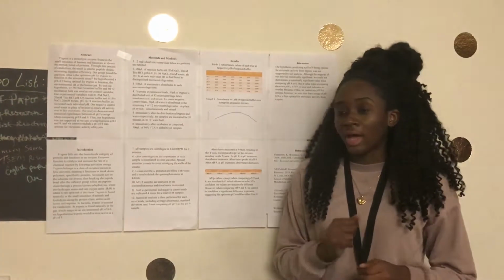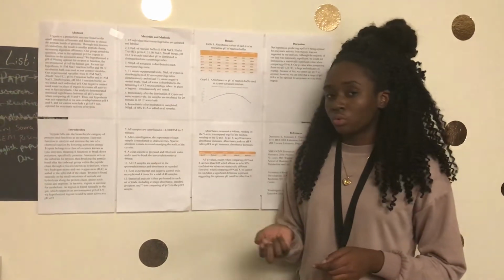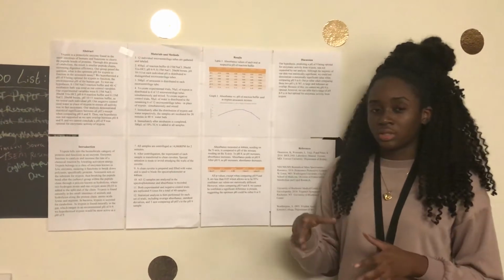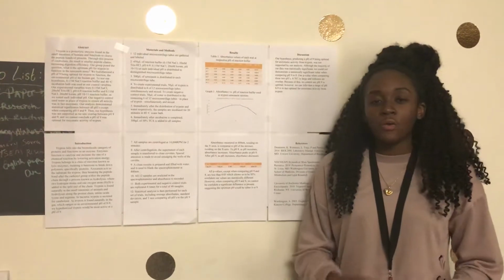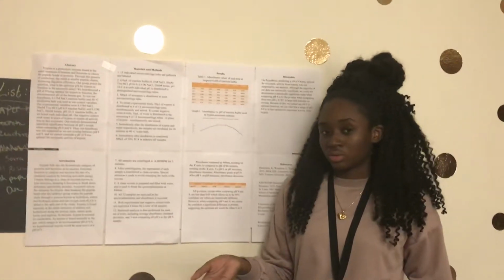After this, to create our experimental trial, we added 50 microliters of trypsin into 6 of the microcentrifuge tubes out of 12, and for our negative control trials, we added 50 microliters of water instead of trypsin into the remaining 6 microcentrifuge tubes. We did this to test the difference between a reaction with an enzyme and without an enzyme.